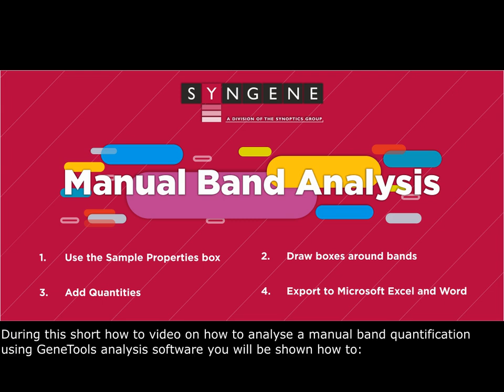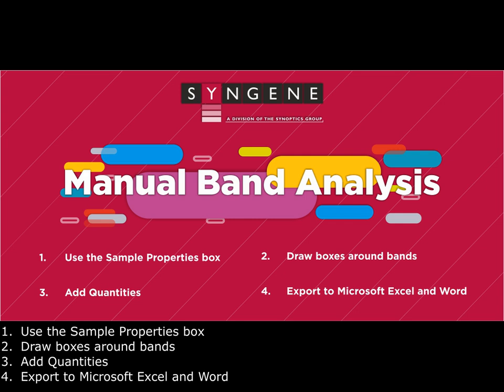During a short how-to video on how to analyse a manual band quantification using GeneTools analysis software, you will be shown how to: 1. Use the sample properties box, 2. Draw boxes around bands, 3. Add quantities, 4. Export to Microsoft Excel and Word.